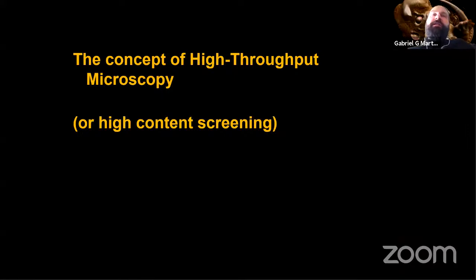Now I want to step back a little bit and go back to something that Hugo was just saying in the session before, the concept of high throughput microscopy. This has been another very interesting development of microscopes in the last few years, where everything has been automated, motorized, and controlled by software. And those of you who have used modern microscopes have gone through this frustration of having to learn all of these complicated softwares and options and things to do.